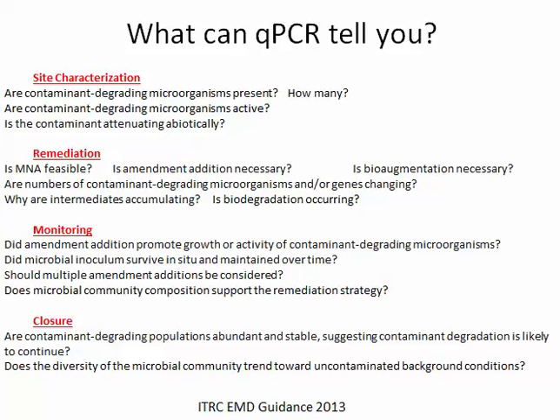So here's the money shot. Sites go through stages, and qPCR can provide useful and actionable information at every stage. Some of the questions that can be answered include, are contaminant-degrading organisms present? If so, how many? Is monitored natural attenuation feasible? Are amendments necessary? Is bioaugmentation necessary?